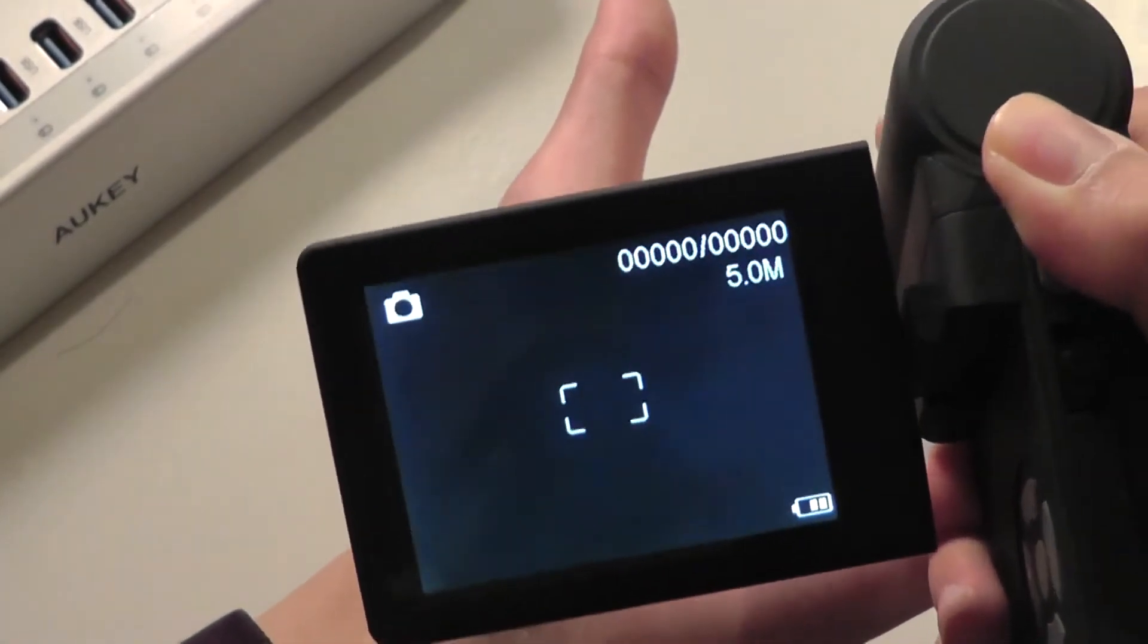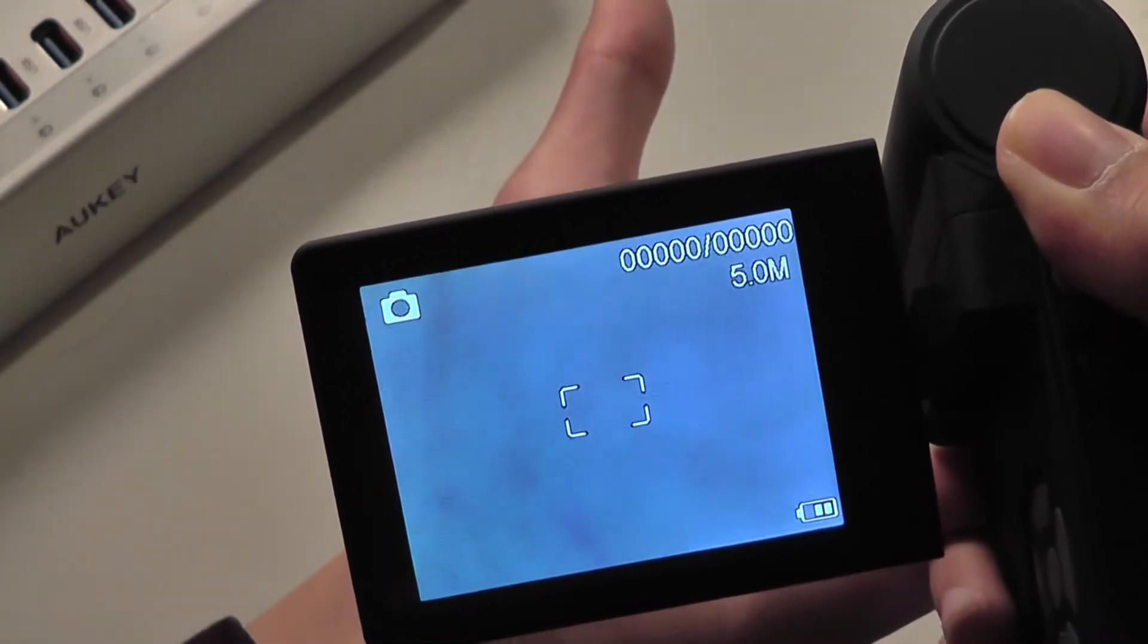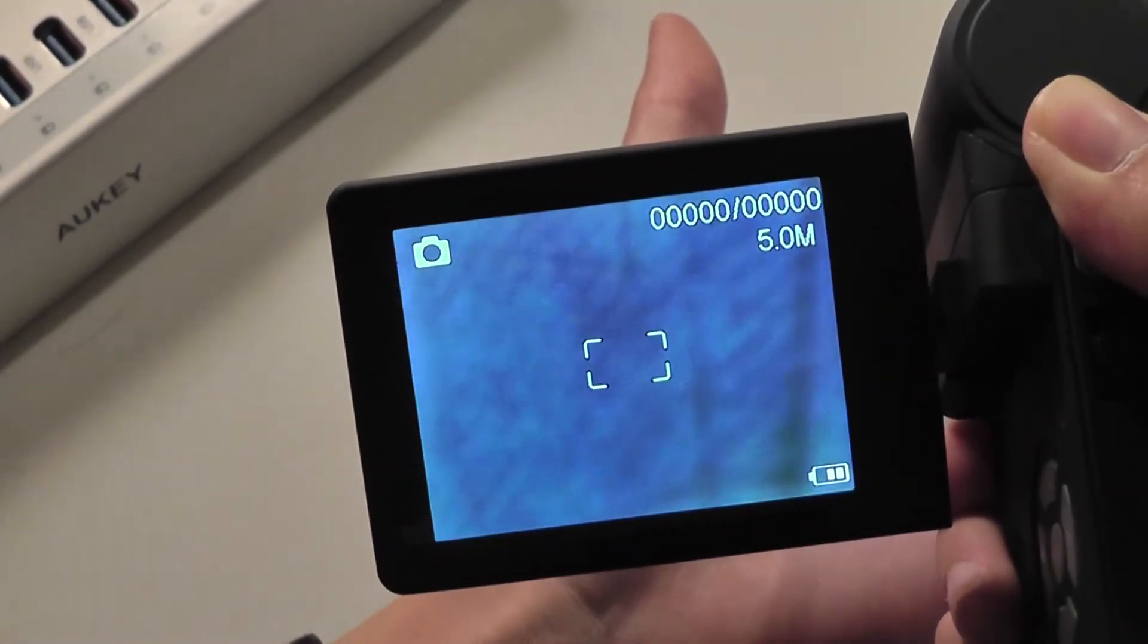Overall, it's a generally pleasing experience. It's easy to get the device into focus by playing around with it. Pretty impressive performance in general, I would say.